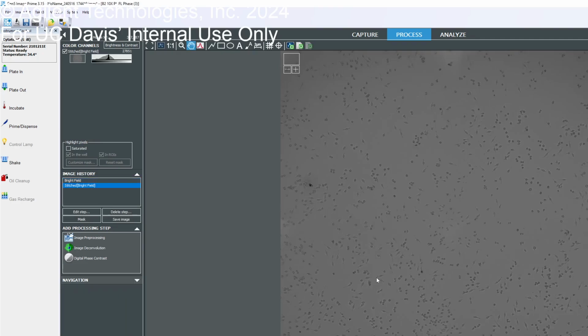And this is the station. We wanted the long slide, a bigger picture of the whole thing. It takes 10% overlap by default because it needs some information to match and then stitch one composite of the whole slice. So the default options work really nice for the most part. So that's how you do stitching.